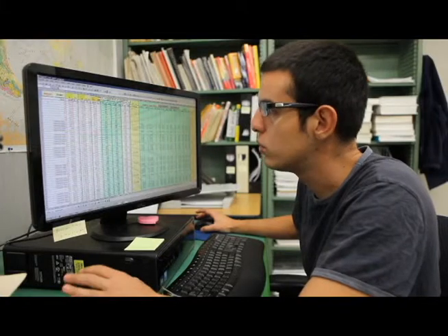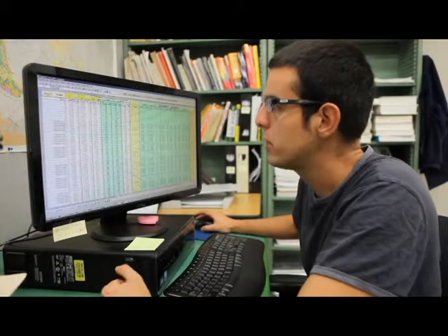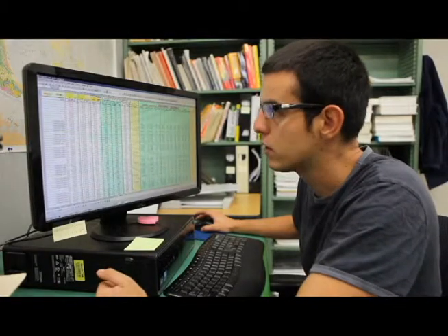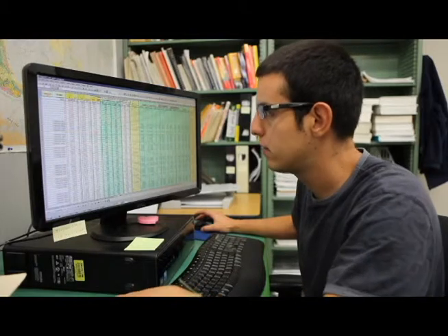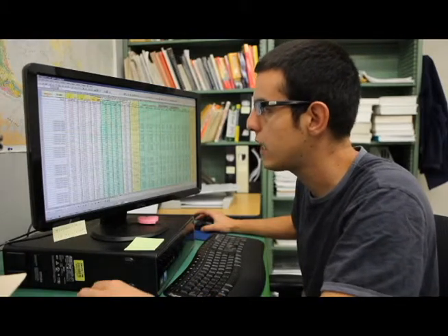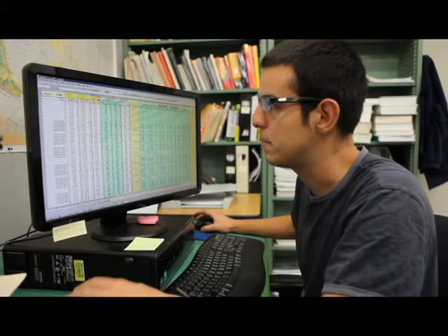So one thing that you don't want to do is just set this parameter right in the middle of a population, because what can happen is you can artificially generate two peaks, one by having half of that population use the 206-238 age as the best age, and the other half use the 206-207 age as the best age.